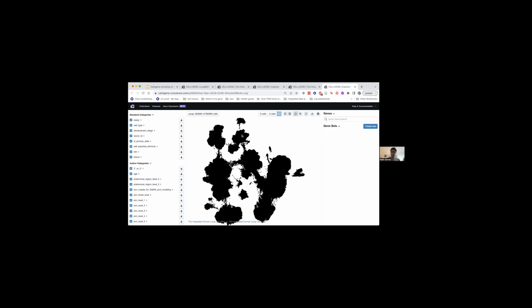Usually this two-dimensional canvas is constructed by UMAP, which lets you separate all the cells into defined clusters that are defined by their gene expression profiles. So it's just a way to nicely separate all the different cells in a given study and group them usually by cell types.